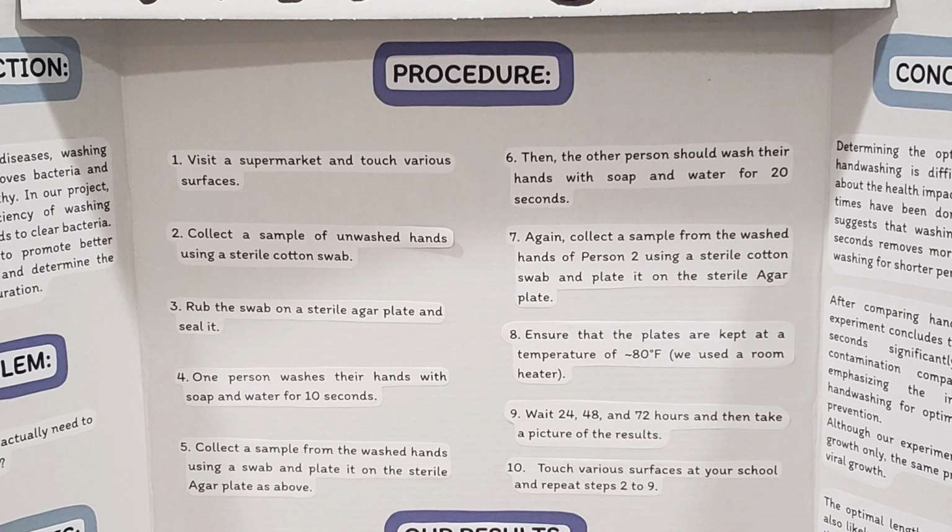Wait 24, 48, and 72 hours and then take a picture of the results. Then the last step was touching various surfaces at our school and repeating steps 2 to 9.